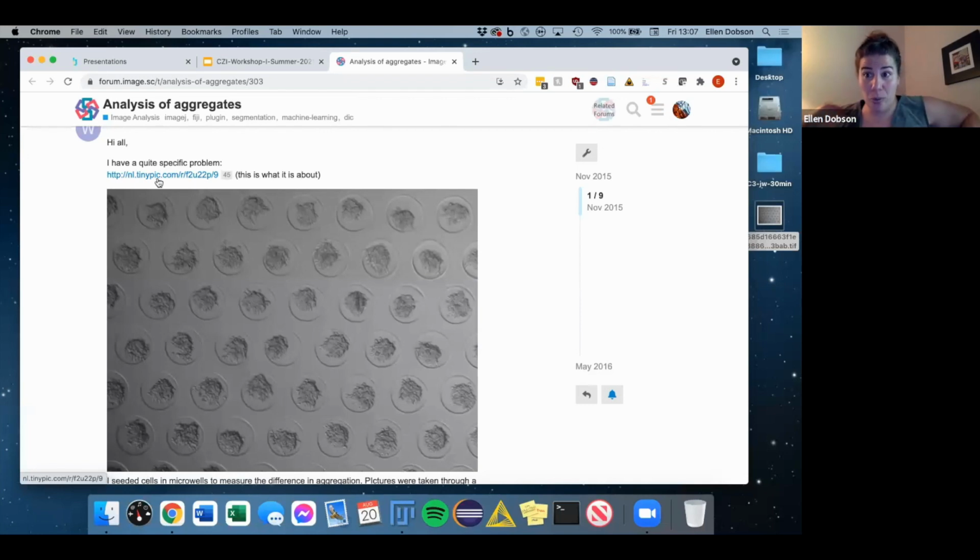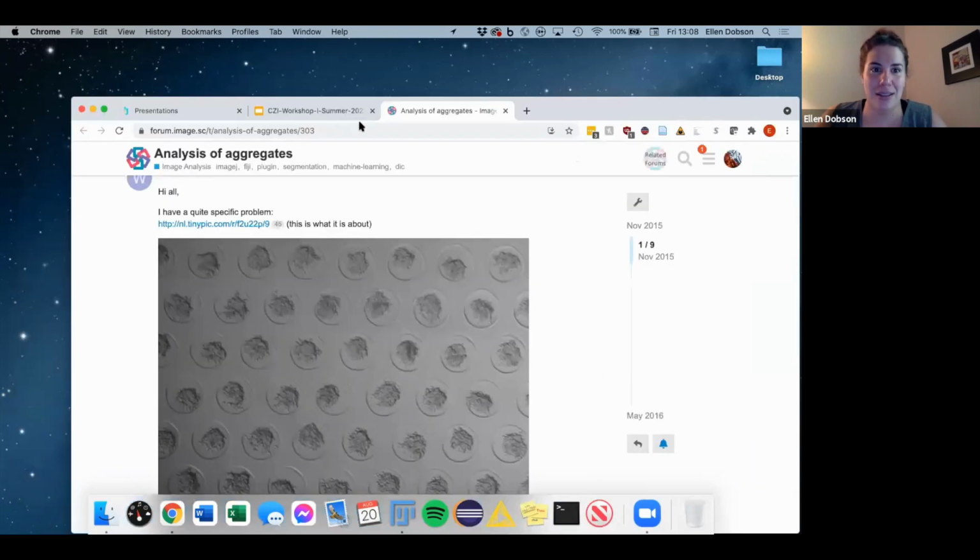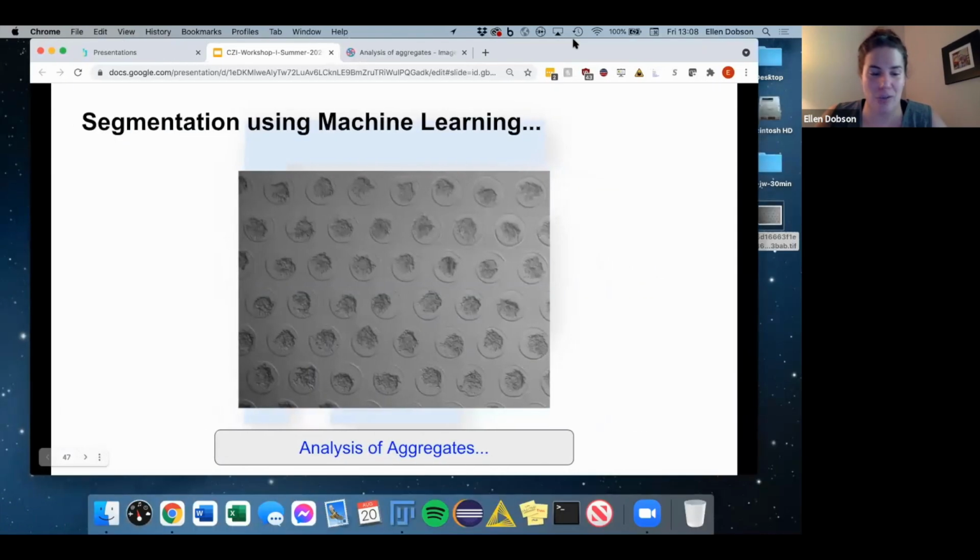If you want to do it with me, it's a good idea to have this image downloaded. It is unfortunately a JPEG, which is a huge no-no. So I saved it as a TIFF, even though it doesn't matter, the data is already corrupted. But yeah, don't ever save your images as JPEGs. We're going to open this now in Fiji and run this example.